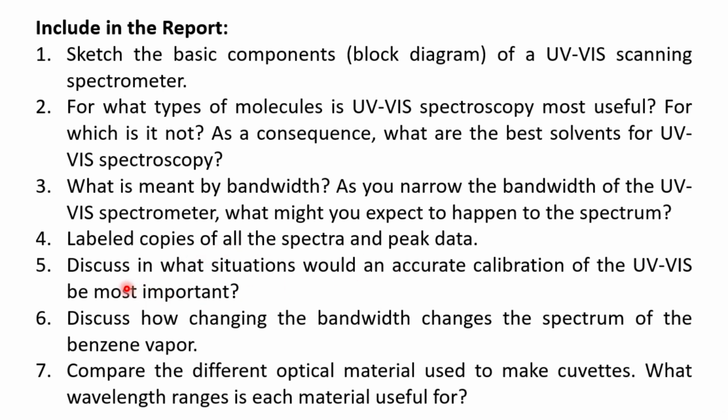You should be able to discuss in what situations an accurate calibration of the UV would be most important. So when do we need to calibrate the instrument for it to work very well, so it doesn't affect the results you have? There are quite a number of these discussion topics that you need to add to your report.